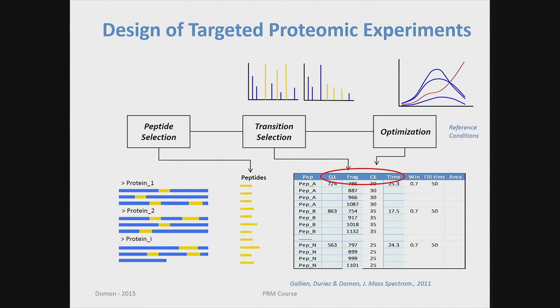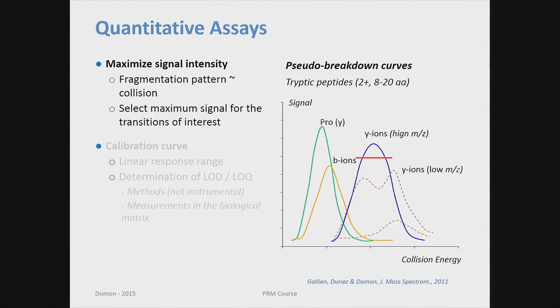So it is actually a fairly long and tedious process, because you need either to have already your spectra, your peptide measured, or you have to go to a database and you build your method. It's a very good tool to do that. You can do the method, and eventually you build the method, you upload the method to the triple quadrupole, you measure, and you get your data. So you've seen that. I will not discuss it any further.